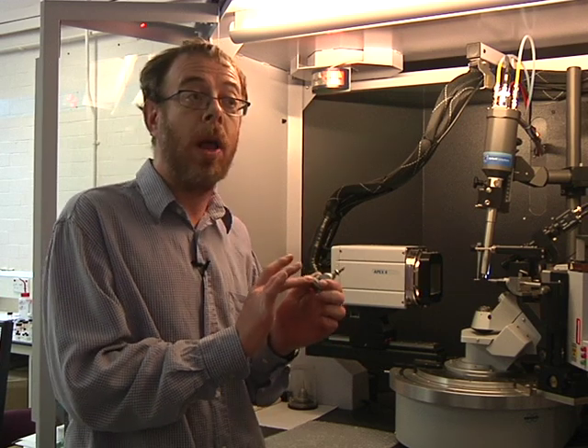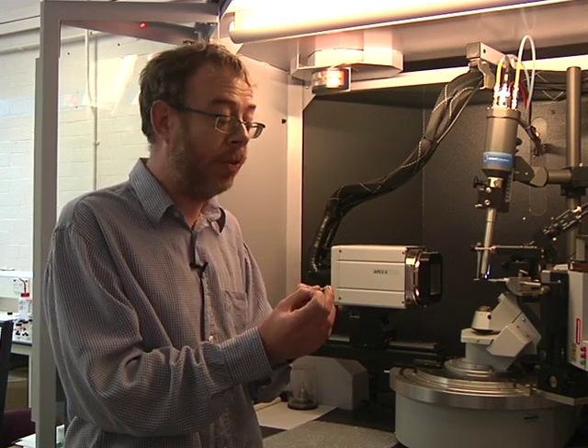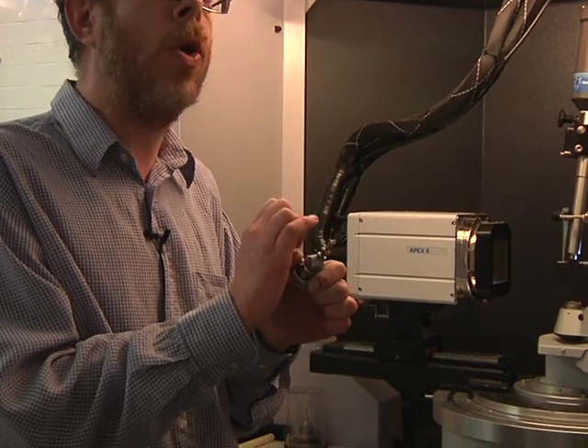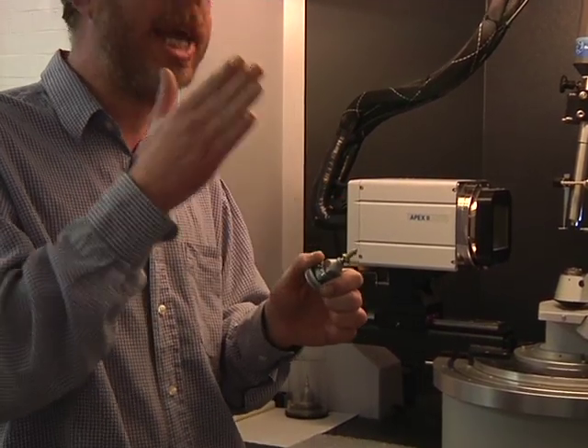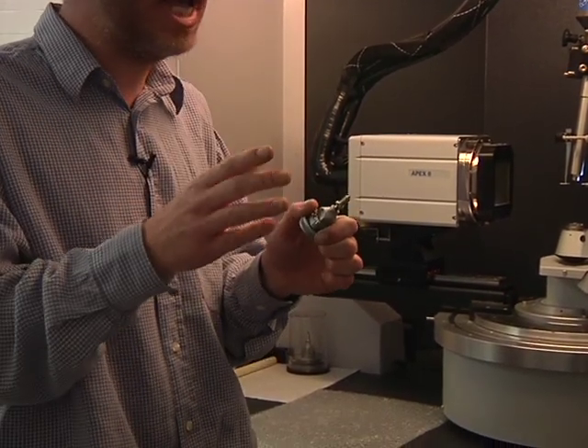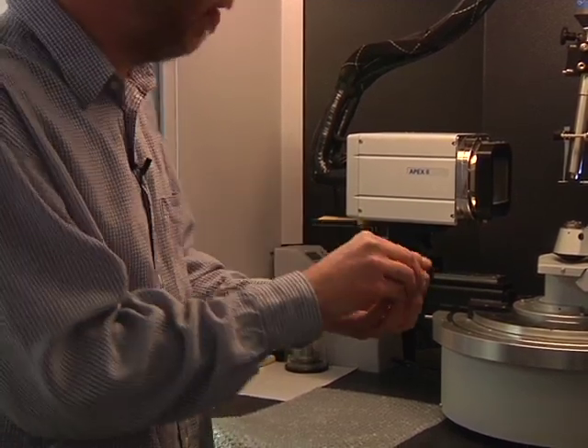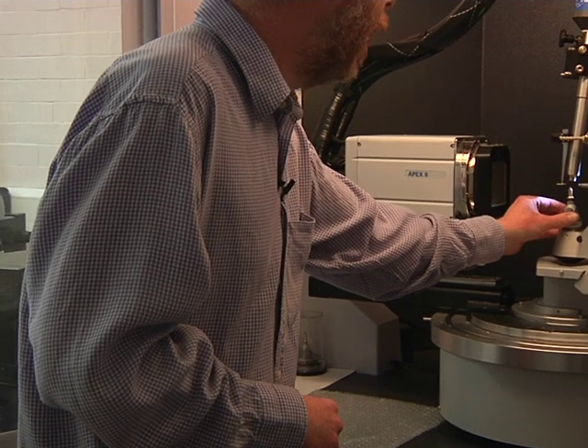I've got what we call a goniometer, a little glass fibre. And on the end of there, that you can't actually see with the human eye, is a little crystal. The most important thing with that crystal is all the atoms are aligned in a regular fashion. They're not mixed together, they're all perfectly aligned. And we take our crystal here and we put it onto our machine.